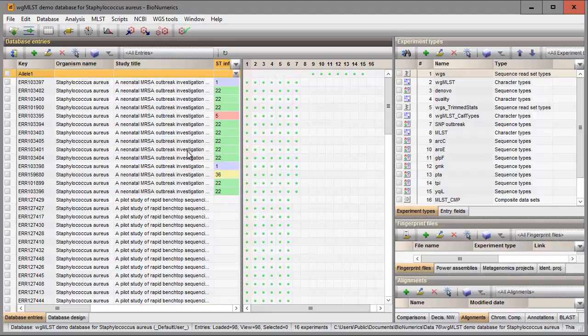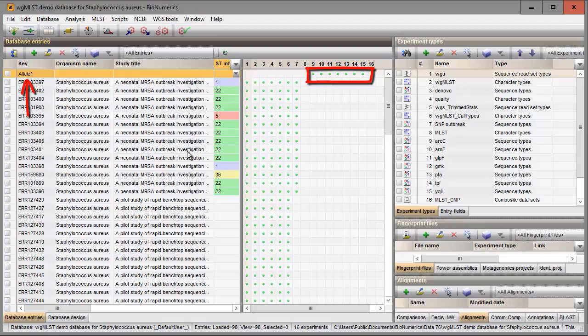One entry is present in my database with a sequence linked to each housekeeping gene experiment. These sequences correspond to the online allelic sequence with allele number 1 and will be used as query sequences when screening our other entries in the database.